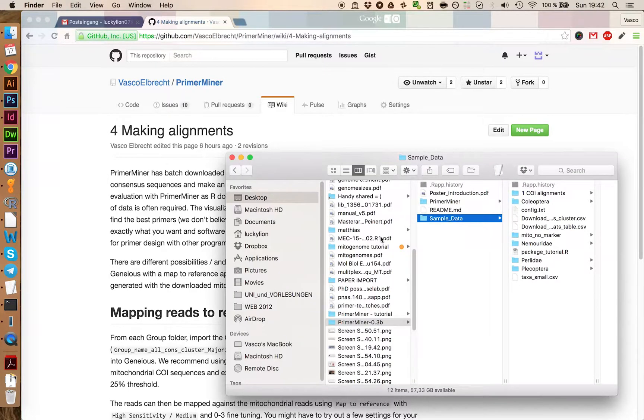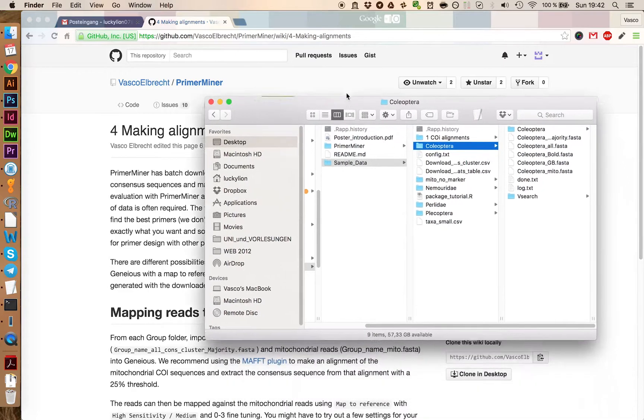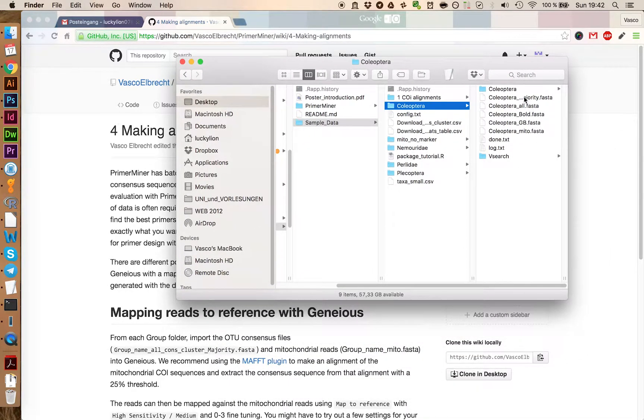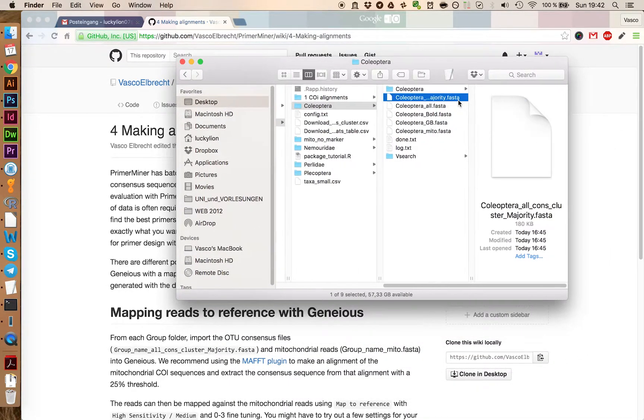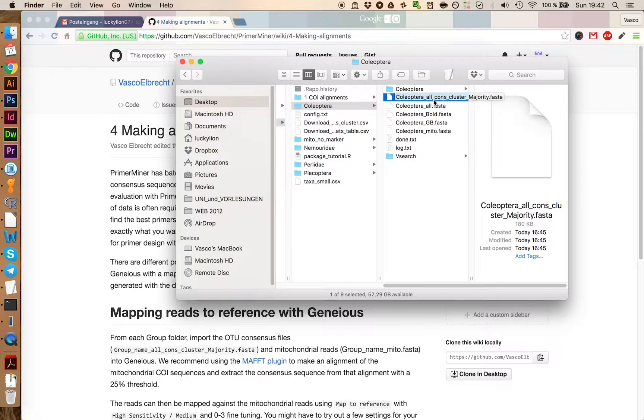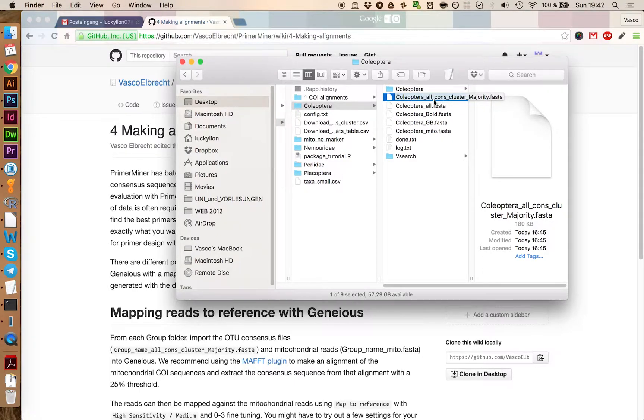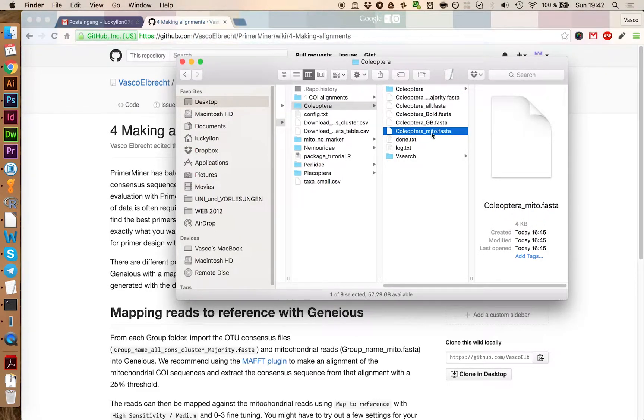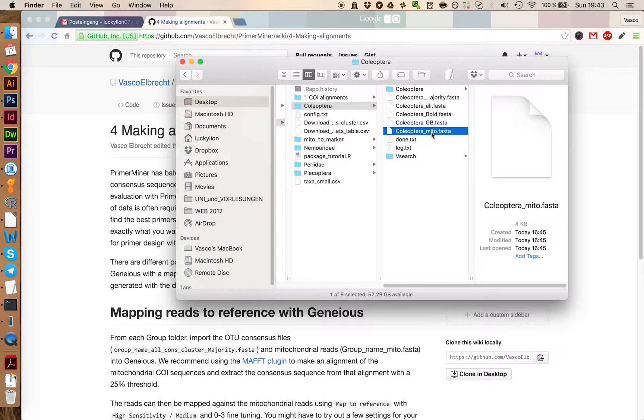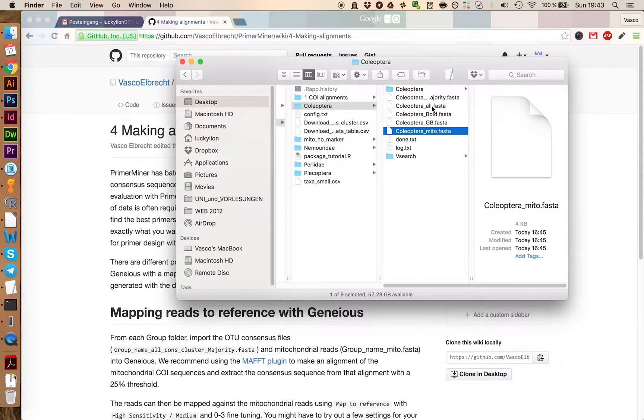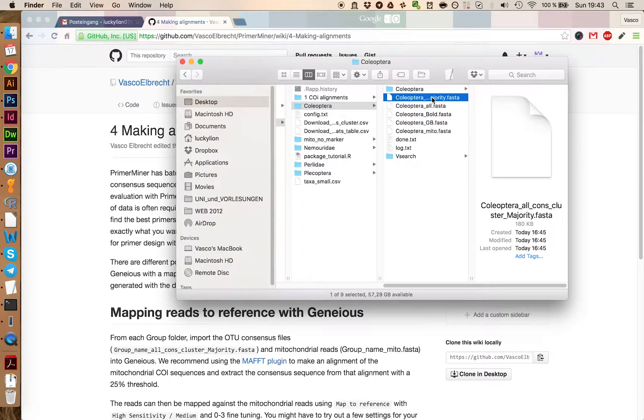Let's take a look at our folder. We are going to do this as an example on the Coleoptera, and we have in here the Coleoptera all-cons-cluster-majority-fasta file. Those are the OTU consensus sequences that PrimerMiner has generated for us. We are also going to use the Coleoptera mito file here, which contains all the mitochondrial sequences. We are going to use this as a backbone to map the OTU sequences against.